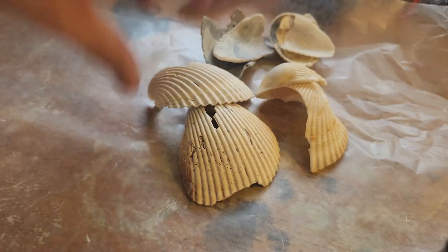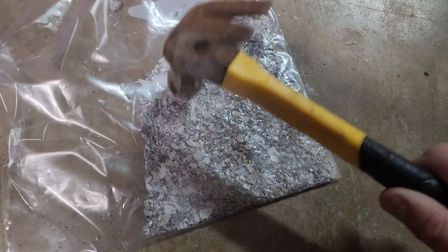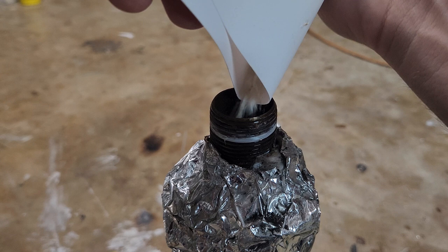Let's crush up some shells to feed them into the furnace. I started off by crushing the big ones on a piece of wax paper, but it quickly became apparent that I need to do this inside a bag. They're still pretty coarse, but these pieces should be small enough to work, so I feed them into the pipe and start baking.